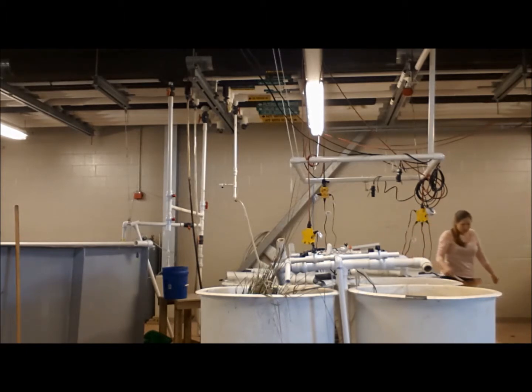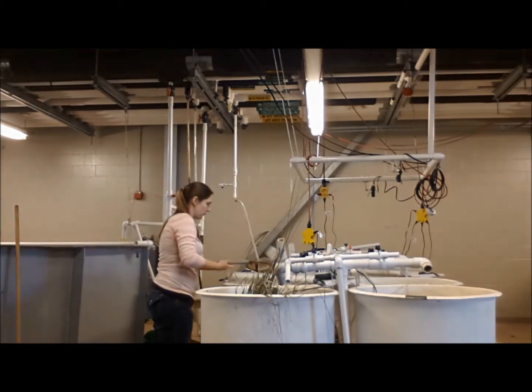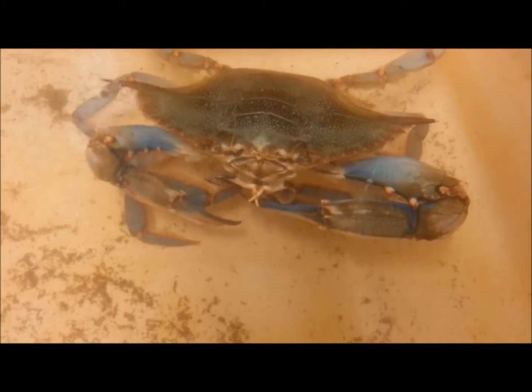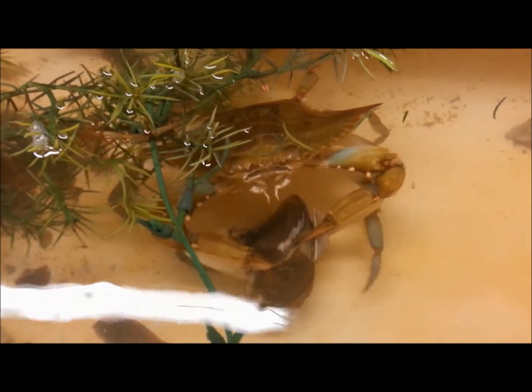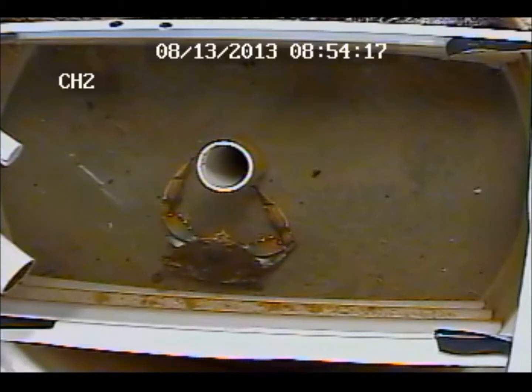I am conducting an experiment to see how blue crab feeding behavior changes depending on the identity of its prey, the habitat where the prey is found, and certain changes that are expected to occur because of climate change. Crabs are allowed to feed in tanks with clams, oysters, or mussels. I watch the video and calculate how long it takes the crab to find its prey, and how long it takes the crab to eat its prey.